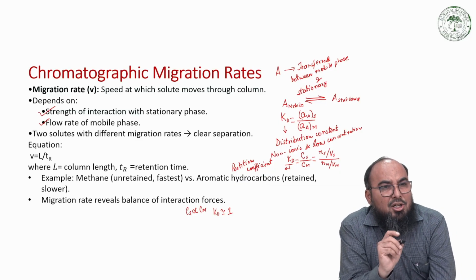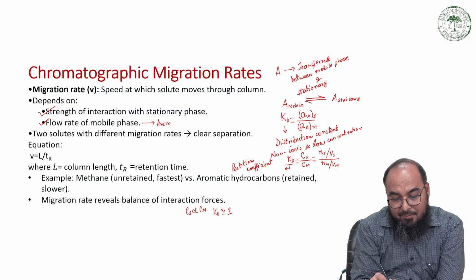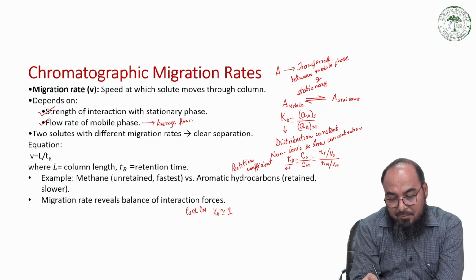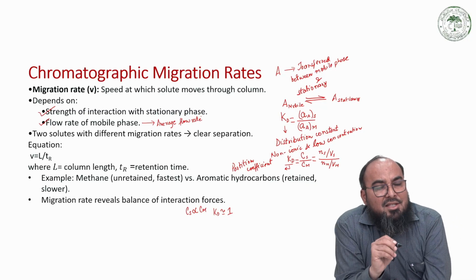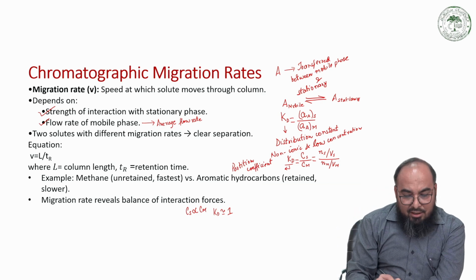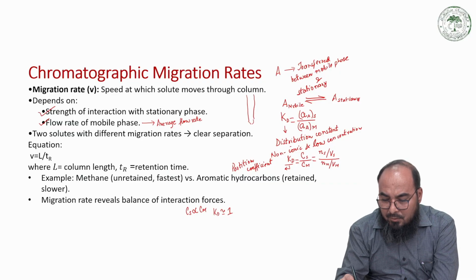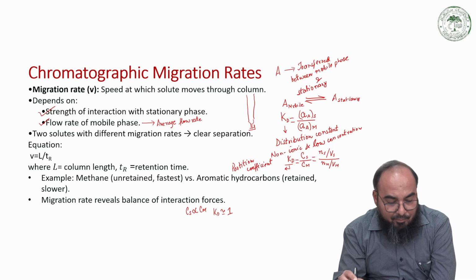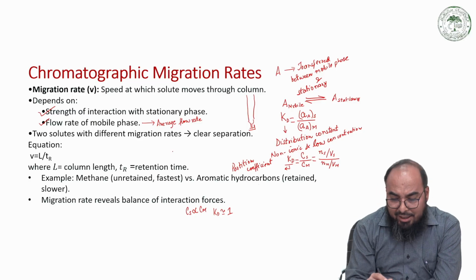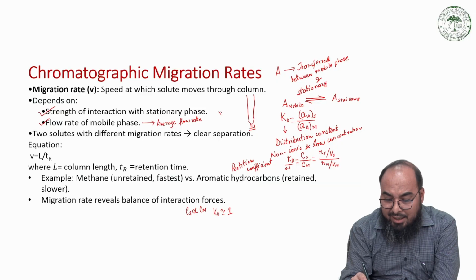Now actually there are two flow rates, and specifically we have to say in terms of average flow rate. In chromatography systems, we always talk about the average parameters. So now suppose you have a column, and this flow rate V may be defined as L upon TR.